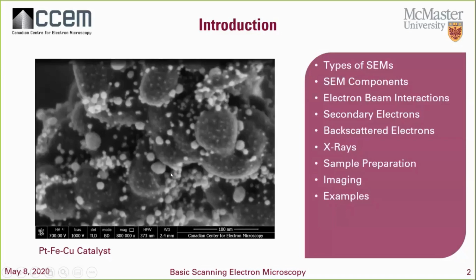It's important, though, that you properly dehydrate the sample. You have to get rid of the water and not change the structure of the material. Properly dehydrating is the biggest thing. Coating-wise, if you have iridium or gold, palladium or chromium, that's a good choice if you have to work above about 30,000 times.